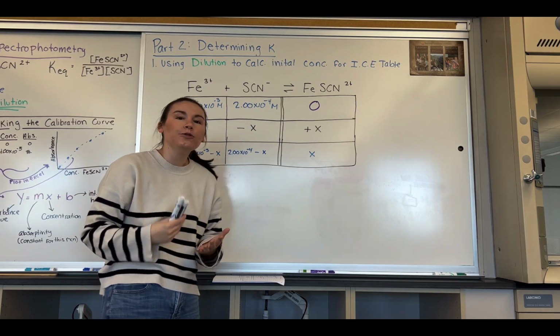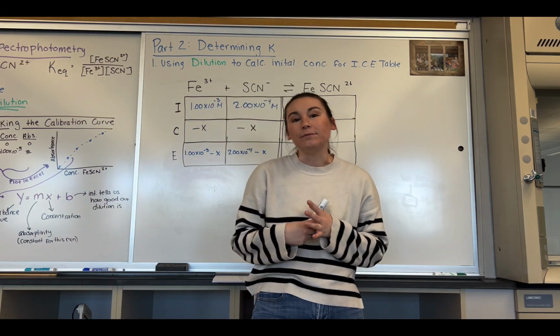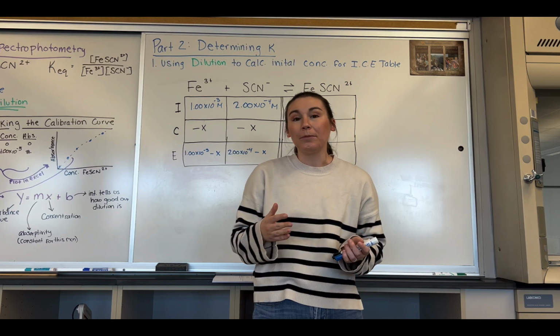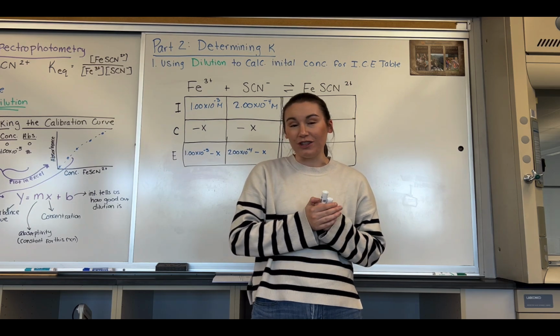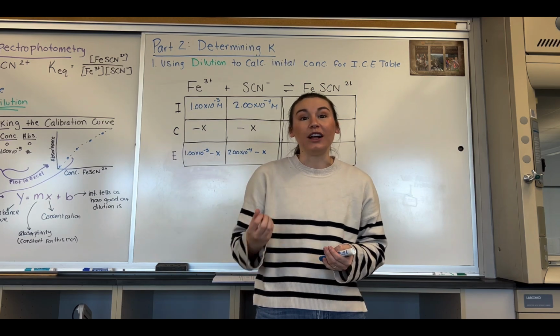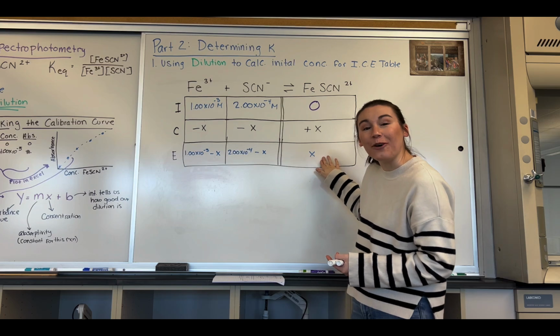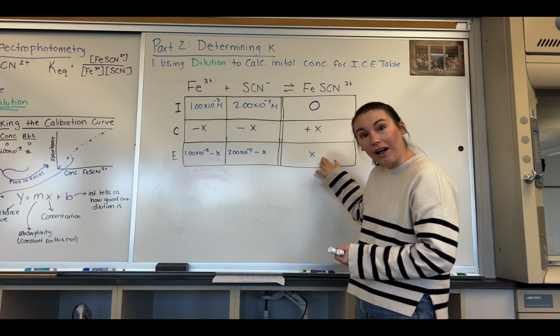Okay, so how do we solve for X? Well, that's where our y equals mx plus b equation comes in. Remember, y was the absorbance of whatever our solution was, and x was our concentration. X is the concentration that we need to find here as well.